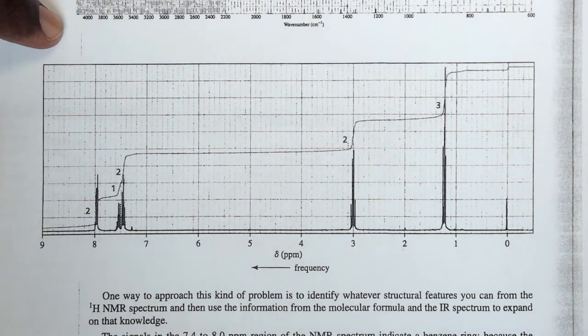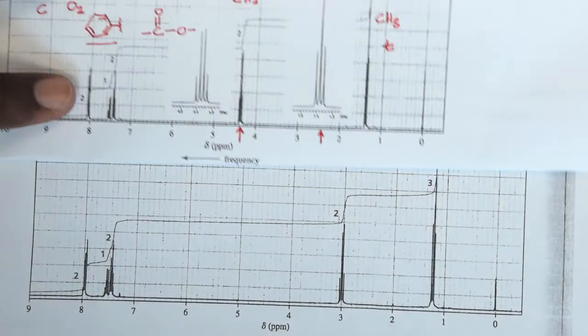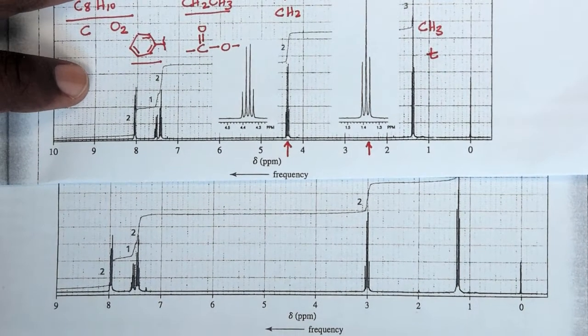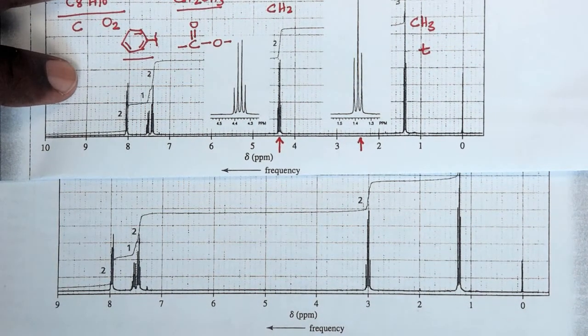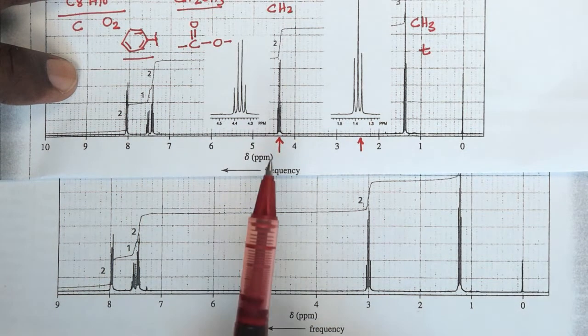So students, this is a follow-up example to the previous example that I've done, and you'll see that the spectra look fairly similar. I can just quickly show you the previous one that we carried out, and then you can compare it to this one. The one that we worked out in the previous video is this.